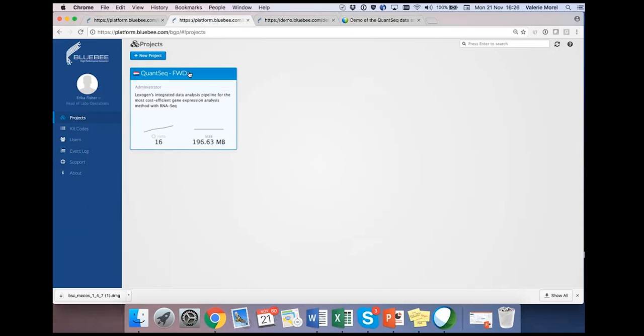Because if you run a forward experiment and afterwards a reverse experiment for QuantSeq, it's hard to compare these two outputs if you want to use TopHat. And with QuantSeq reverse, you cannot use TopHat because of the missing junctions. It's complicated, but we tried it with the QuantSeq reverse with TopHat 2, and it just crashed.